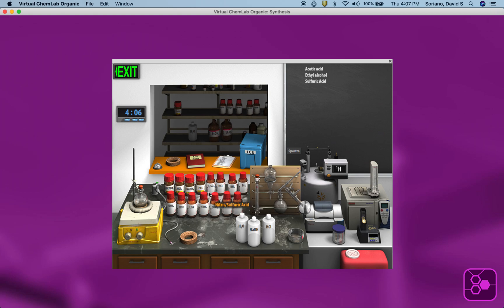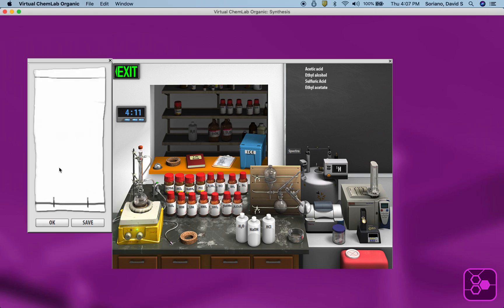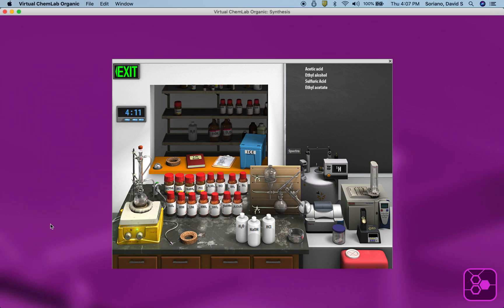See the blackboard? And then I'm going to put a condenser in place. Double click. Start stirring. Reaction's underway. If you add the wrong materials, the glassware will explode — we'll be showing you that in a different video. I can do a TLC, thin layer chromatography, at time zero. And I can save that.